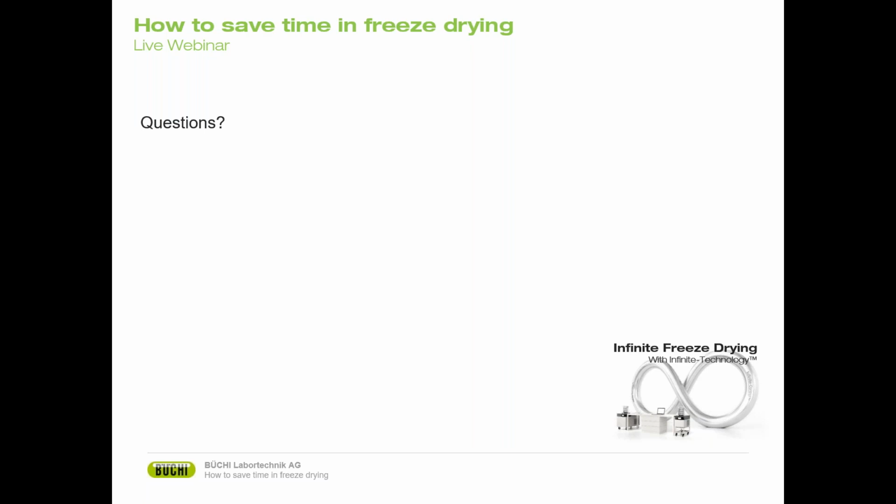You can do that, and it's actually sometimes done. However, now we can again think back to the strawberries, when you have a situation with a constant decrease. We didn't really see this sudden drop. We had a constant decrease. So depending on how exactly the algorithm figures out this drop, this might actually be a problem. But it's done sometimes.